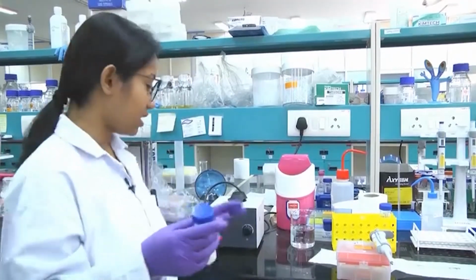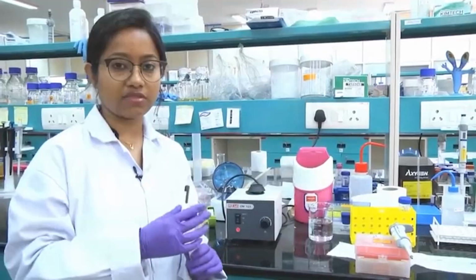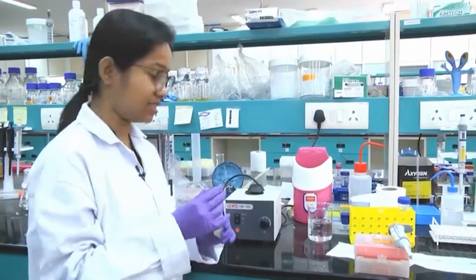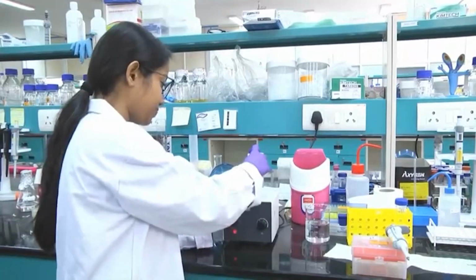Now, when you add another, this is a vortex machine. So, basically we will vortex it so that everything is mixed properly, and this also sometimes helps in lysing the cells. So, now what we are going through is a lysing procedure. Before you start lysing, you add your protease inhibitor and you also mix it properly.